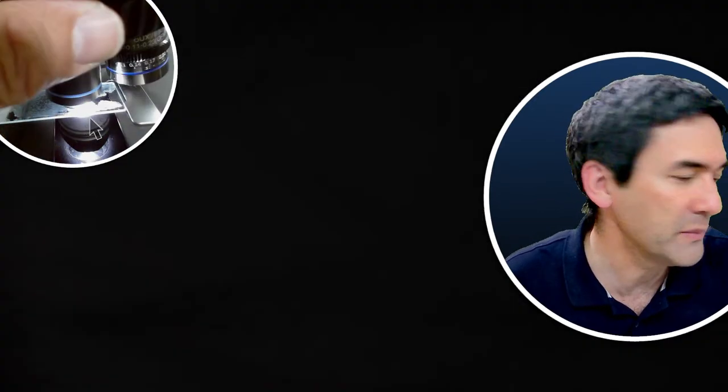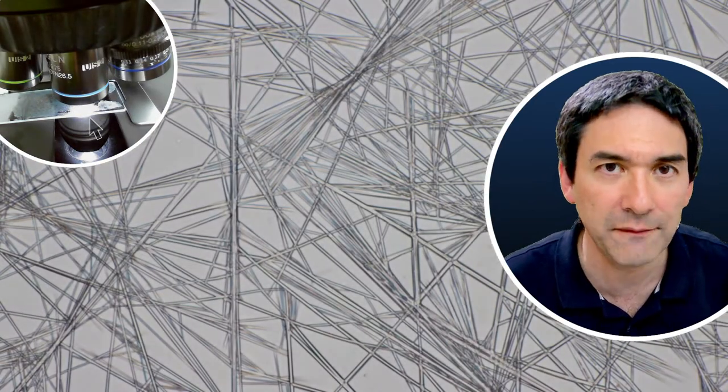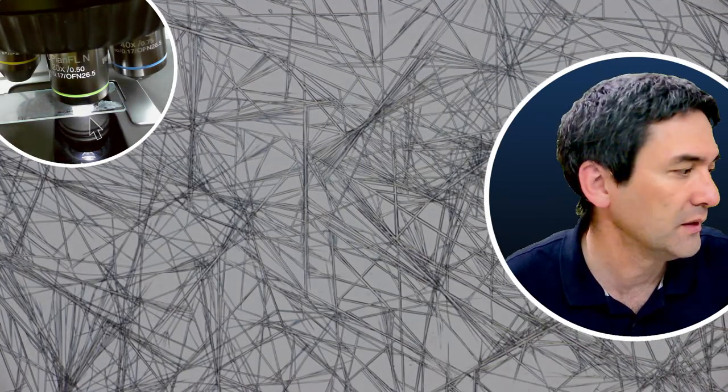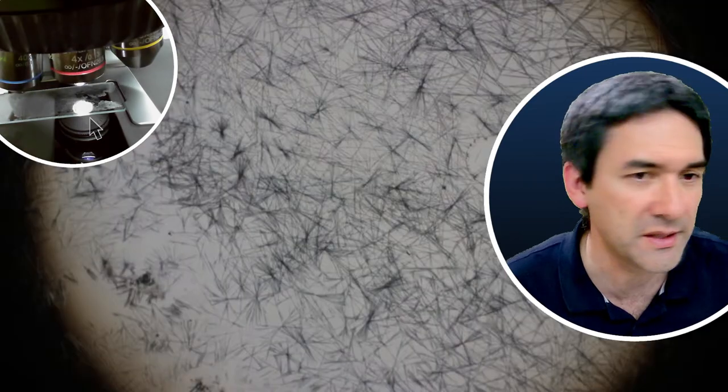So 40 times bright field. These are caffeine crystals for those of you who just joined in. 20 times bright field, I'll go down with the intensity. 10 times bright field. And 4 times bright field.